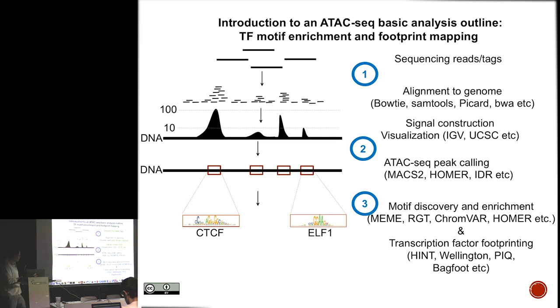So in this case, we see the example of a particular transcription factor called CTCF, which is an insulator protein, which has a unique sequence that it binds to, comparing with ELF1, which has a shorter sequence. So these transcription factors have very specific DNA recognition sequences that they bind to. I will talk about this transcription factor footprinting on a few slides, but I want to focus more on how these analyses are actually informative and some of the technical considerations when doing motif enrichment analysis.